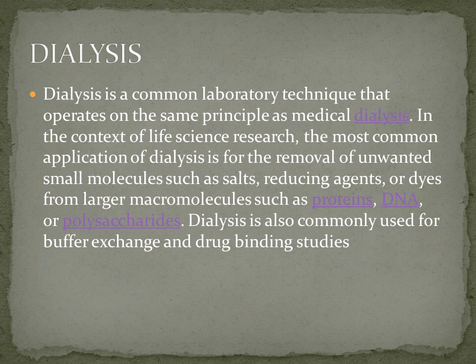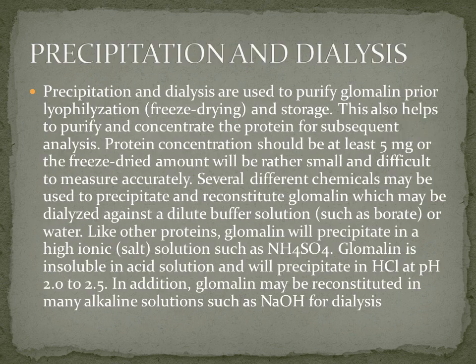In the context of life science research, the most common application of dialysis is for the removal of unwanted small molecules such as salts, reducing agents or dyes from the larger molecules such as protein, DNA or polysaccharides. Dialysis is also commonly used for buffer exchange and drug binding studies.